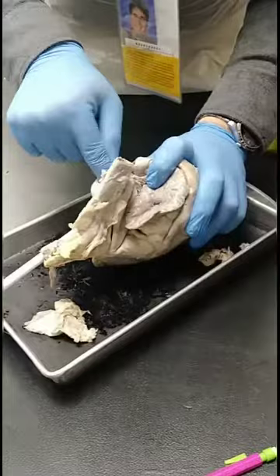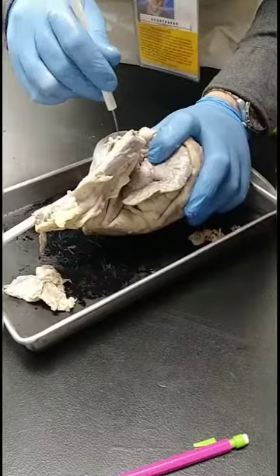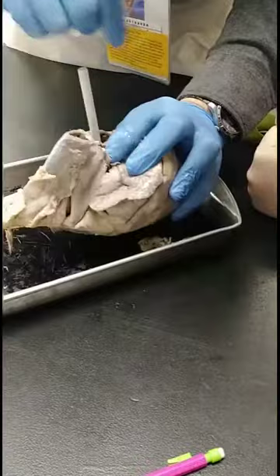All right, so here's one of your probes. See how thin it is? Okay, let's mark that. And just explore it now.